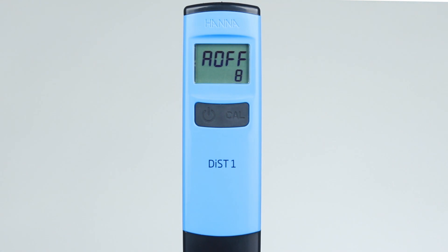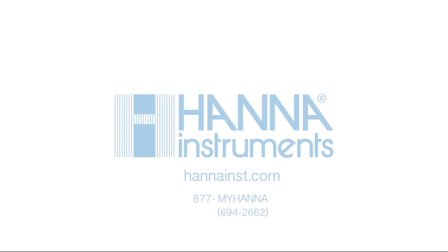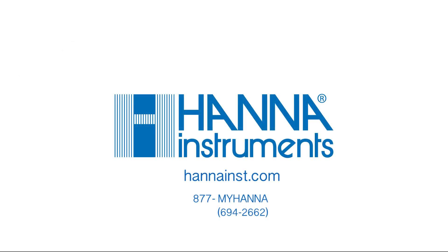Pressing the ON-OFF button again exits the setup mode and the meter is back in measurement mode. We hope you have enjoyed this product video, and for more information, please contact us at 877-MYHANNA or visit us at hannainst.com.